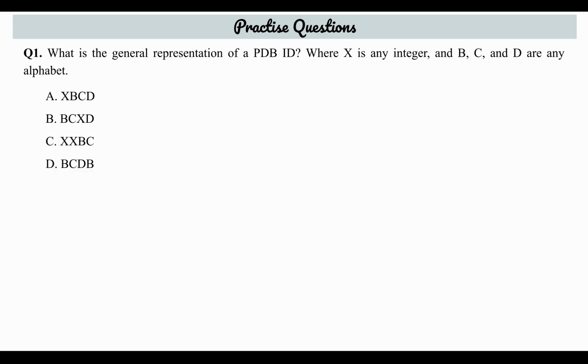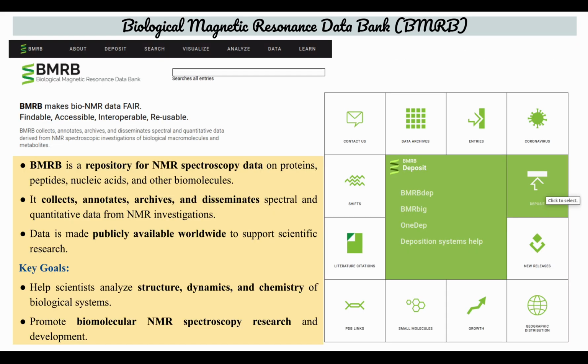Okay, so till now we have seen everything. I hope it is clear till now how the cryo-EM works. Today's session was entirely dedicated to protein structural determination using cryogenic electron microscopy and different types of EM, and how it is uploaded to different databases and what information each database provides you.